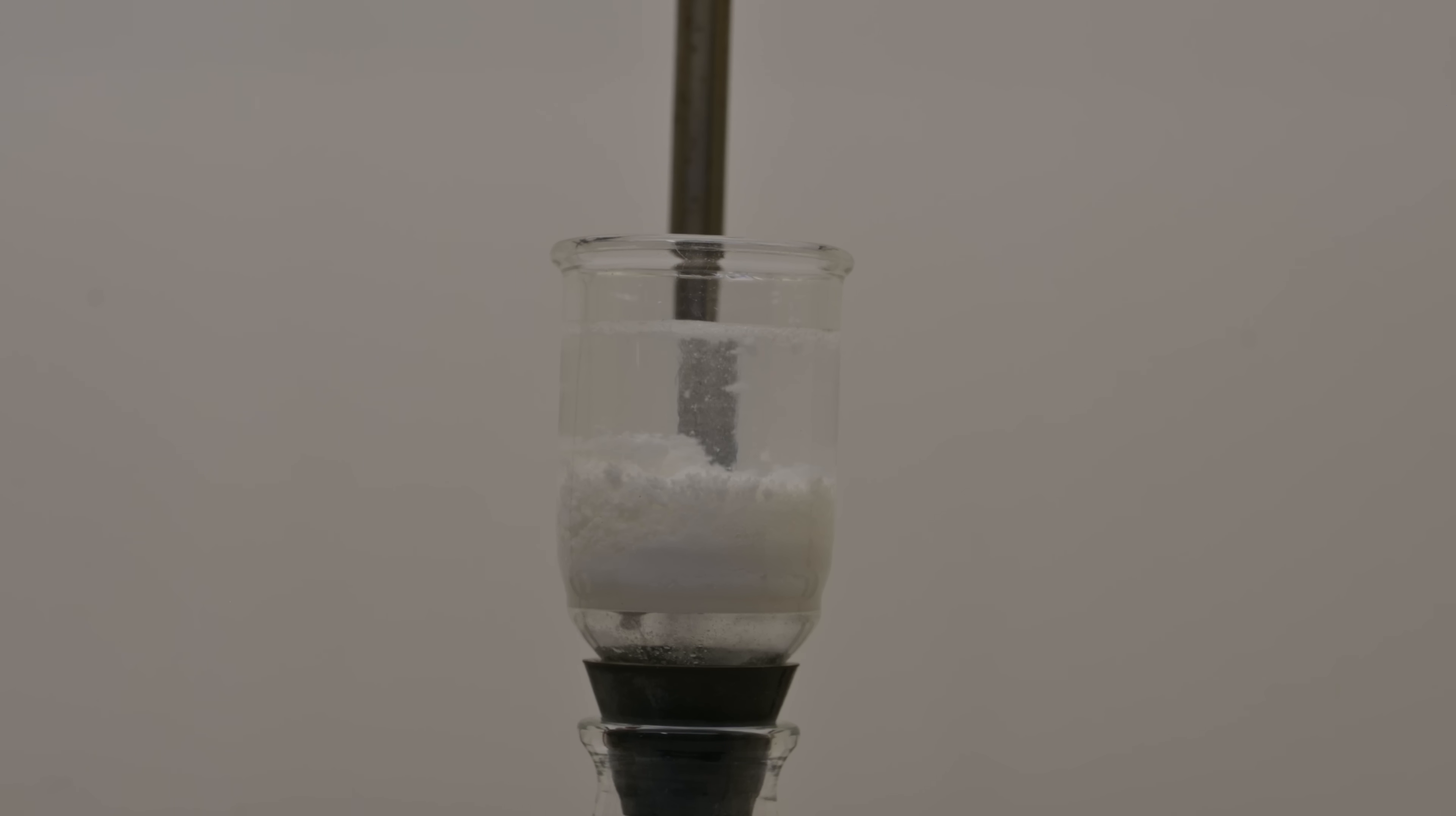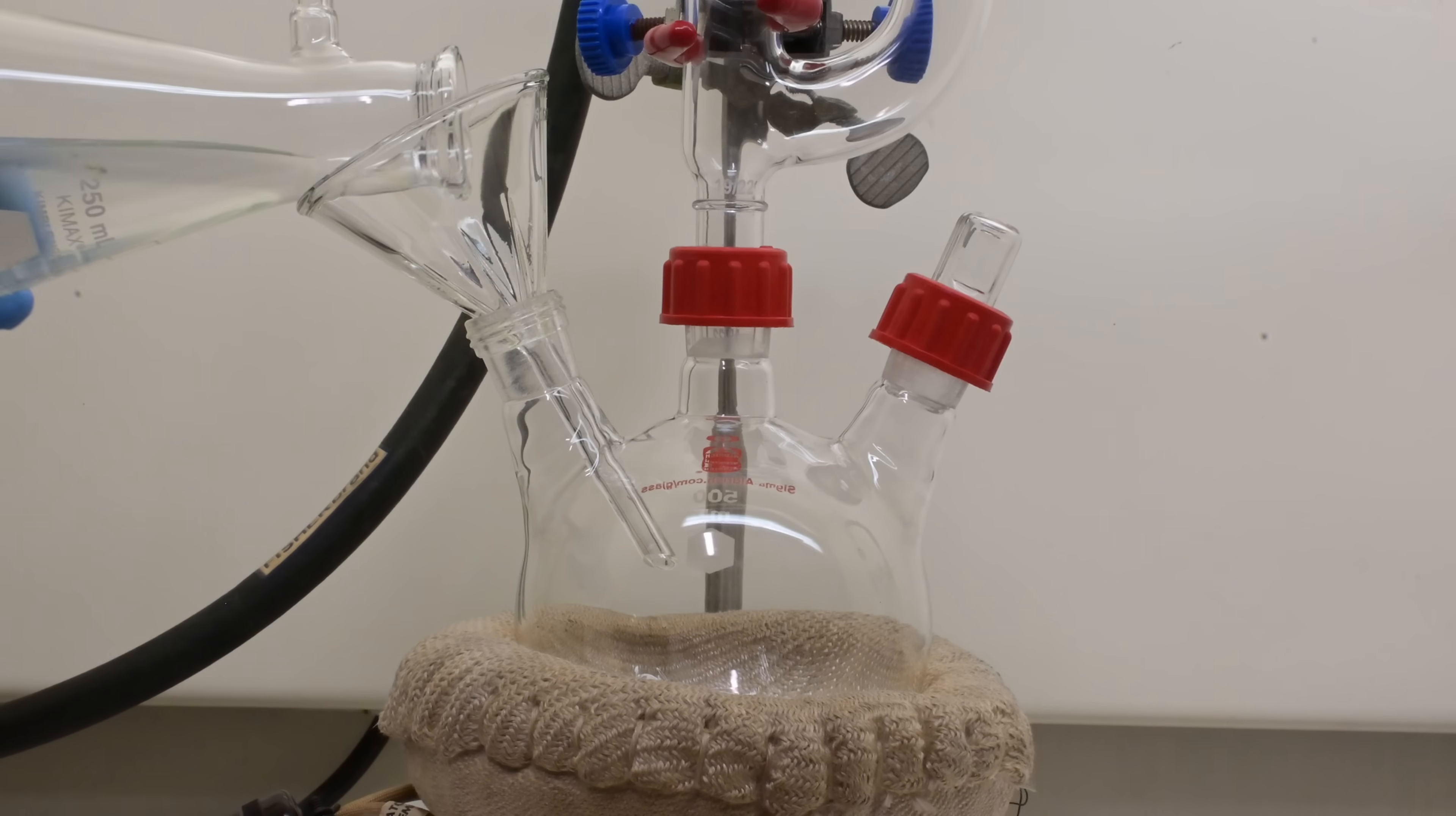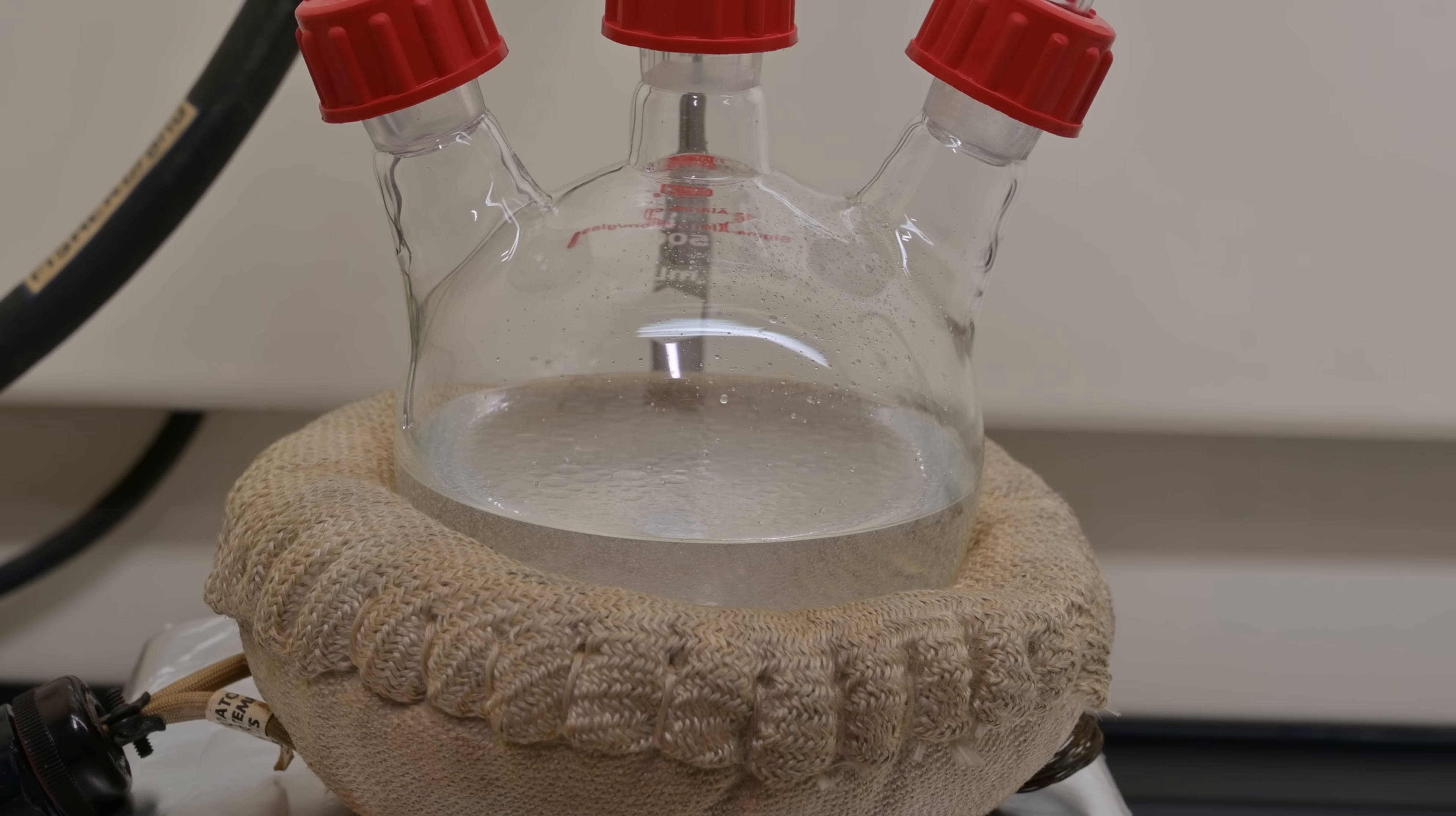The next step is to recover benzaldehyde in its unbound form from these crystals. To do this, I added an excess of dilute sulfuric acid around 5 molar. Concentrated sulfuric acid can be purchased as drain cleaner. The acid breaks the bisulfite adduct apart, releasing pure benzaldehyde. To further purify the benzaldehyde, I perform steam distillation. We transfer the sulfuric acid and benzaldehyde to the boiling flask and add some excess water to the flask. The typical steam distillation setup is similar to that of simple distillation, with the main difference being the use of a Claisen adapter. This technique is particularly useful because it allows benzaldehyde to distill at a lower temperature than it normally would at its boiling point, reducing the risk of thermal degradation.